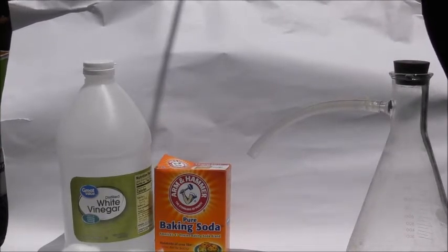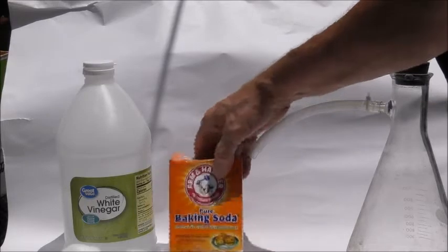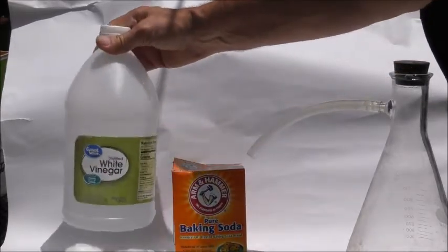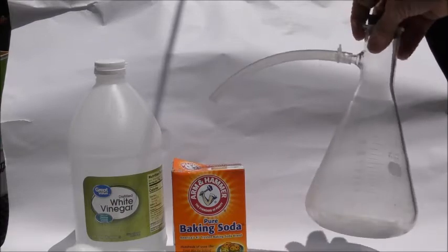One can make a fly anesthesia device with CO2 by using baking soda and household vinegar, and then either a contraption like this that you can get from your chemistry lab.